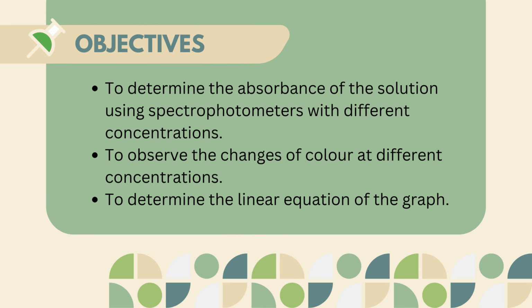Objective: to determine the absorbance of the solution using spectrophotometers with different concentrations, to observe the changes of color at different concentrations, and to determine the linear equation of the graph.